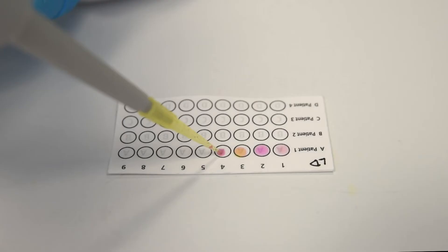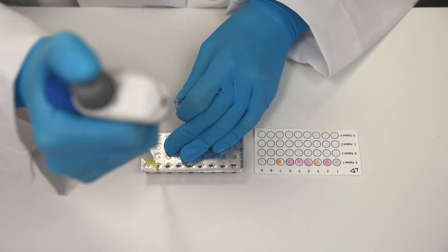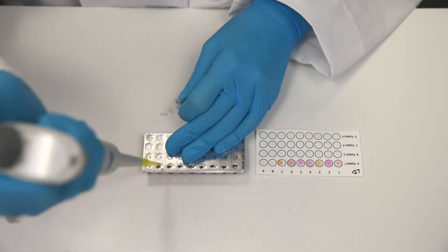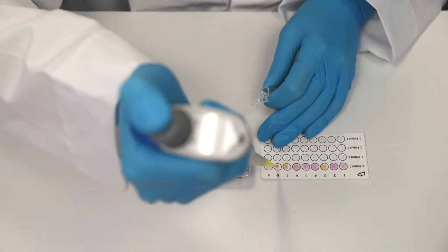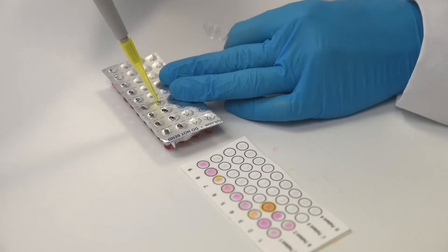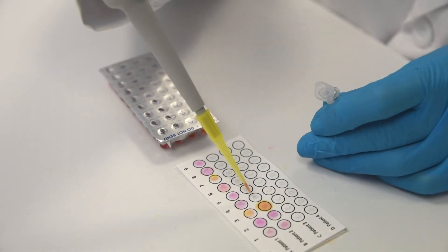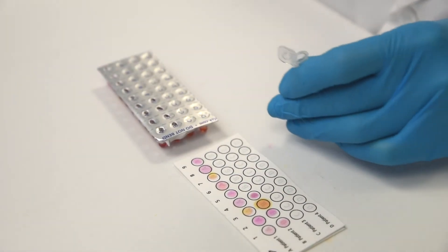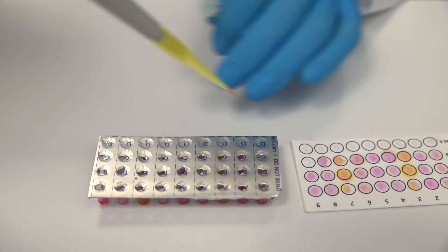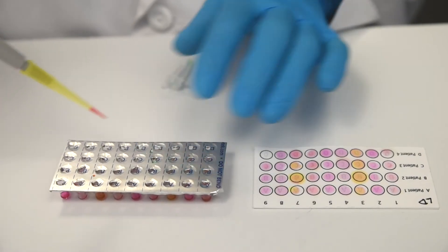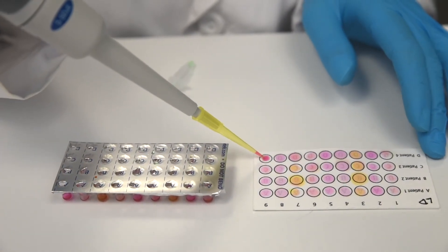Step 8. Continue repeating steps 4 through 6 for each additional well on the top row. Then continue with the remaining three rows. Remember to change pipette tips after each sample. Once all samples have been mixed with control cDNA and added to the paper microarray card, continue with Step 9.